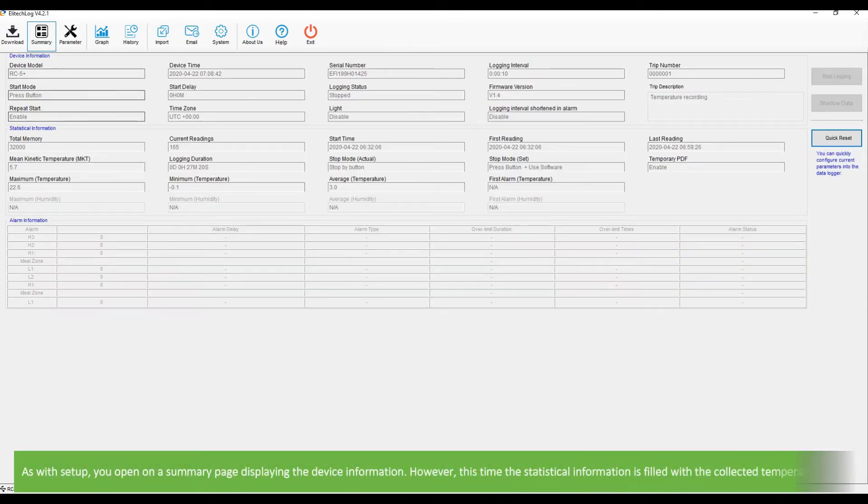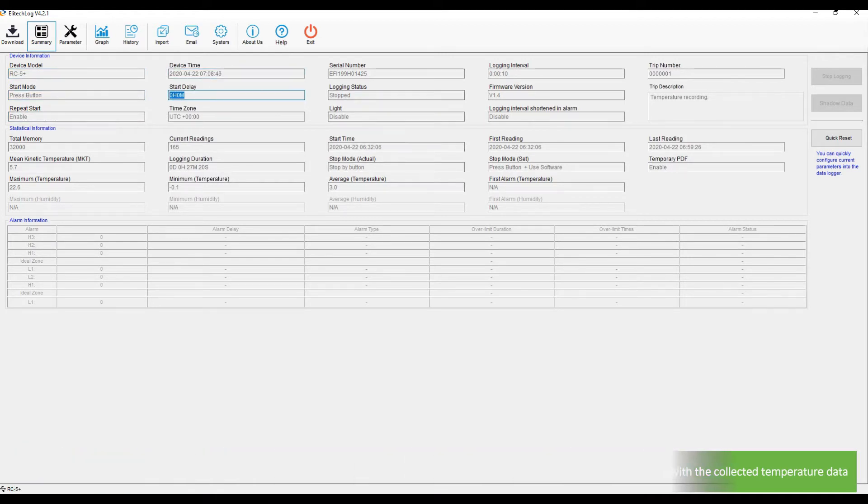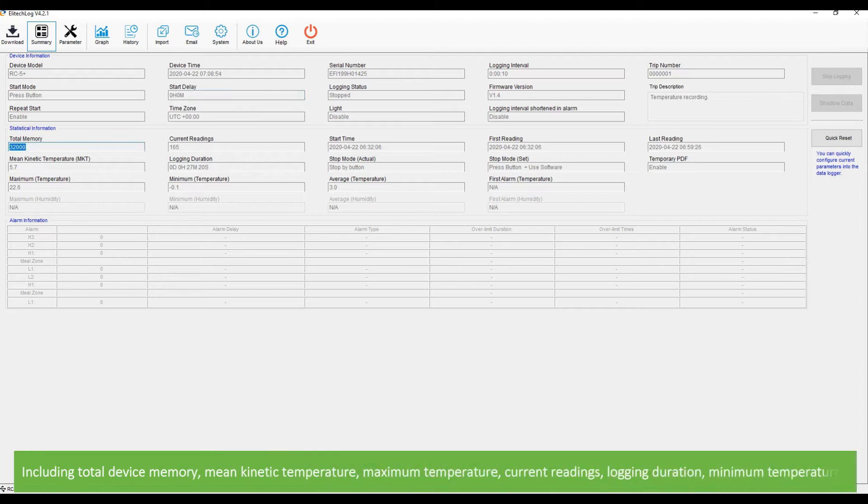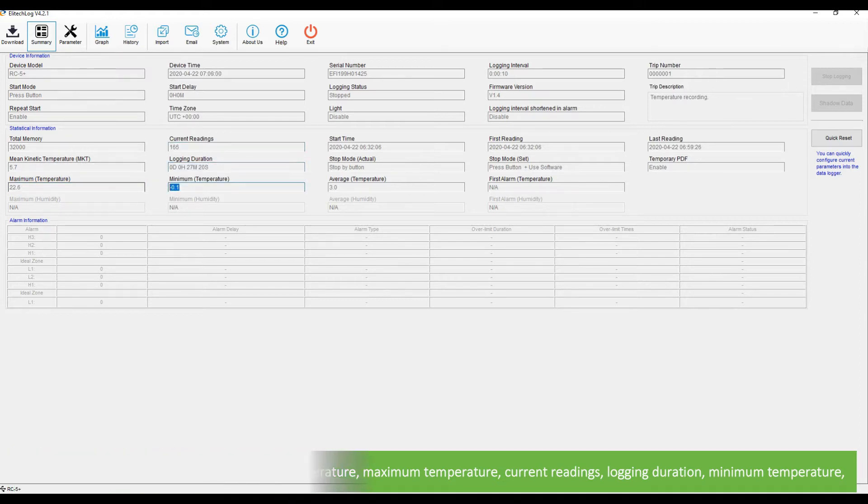The software opens to the summary page displaying device information. This time the statistical information is filled with collected temperature data including total device memory, mean kinetic temperature, maximum temperature, current readings, logging duration, and minimum temperature.